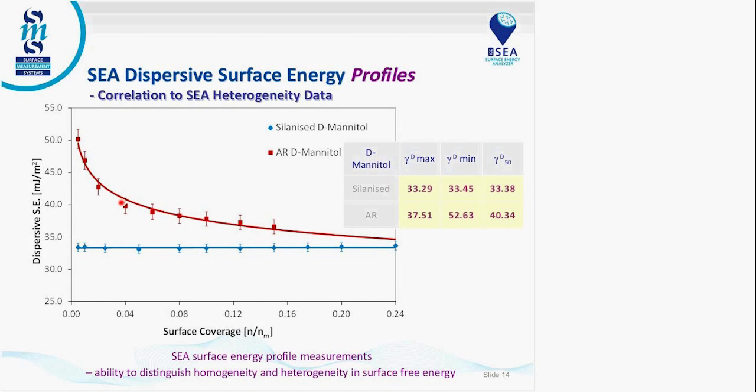So if you measure different samples at the same fractional surface coverage, whether it's by our IGC or a different IGC, or you have different IGCs in different labs, as long as you're at the same fractional surface coverage, that normalizes the data to make sure that you're accessing the same sites. You should get the same answers for a micronized API, whether it's measured in one lab versus another or one system versus another. In the past, you may see in the literature surface energy values ranging by IGC because people didn't take careful time to make sure that they were sure of infinite dilution, or their surface to volume ratios were quite different, such that they may be on different spots of this curve. Real materials are energetically heterogeneous, so it's important to understand that you have to make sure you report values at the same surface to volume ratio to make sure you're comparing apples to apples.